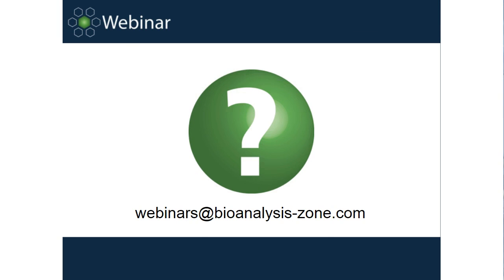We don't routinely compare it to a previous lot unless it's a catalogue product or unless we have an agreement with the customer or they've ordered an extra level of QC. But as I mentioned in my talk, it really depends on the requirement of the customer. So we can prepare a reference lot. Usually what will happen is the customer would like us to prepare 3 separate lots because they want to do some kind of validation. We'll take one of those as a reference lot, aliquot it, and then we can compare all subsequently manufactured lots to that original reference lot. So we'll do a side-by-side, usually a titration ELISA, so that we see how equivalent the two are, and we'll maybe set some parameters for pass-fail based on that.